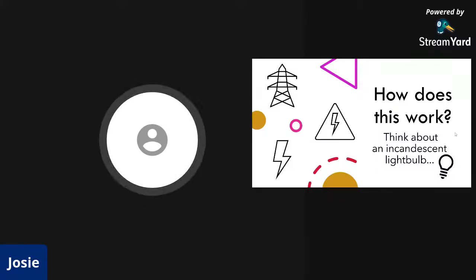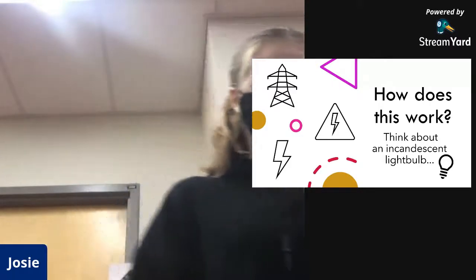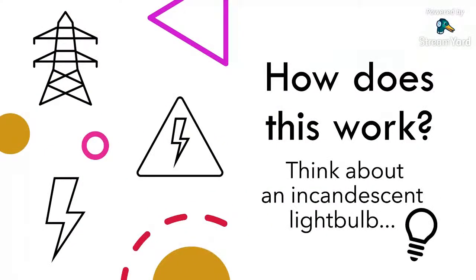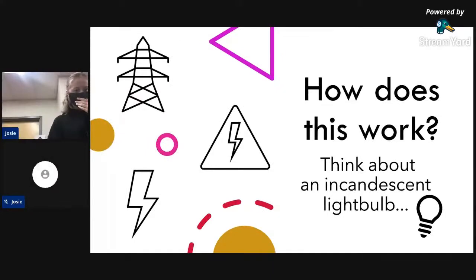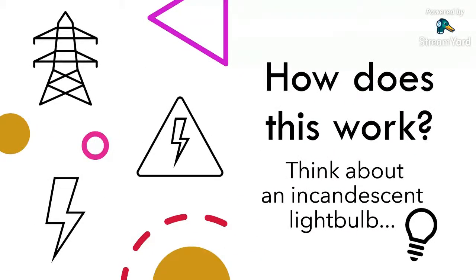So here, it isn't producing carbon monoxide, carbon dioxide, and water. It's actually oxidizing the steel wool, which means that it's basically rusting. And that's why you can see the color change in the steel wool. It turned from that light gray color to that dark gray color.